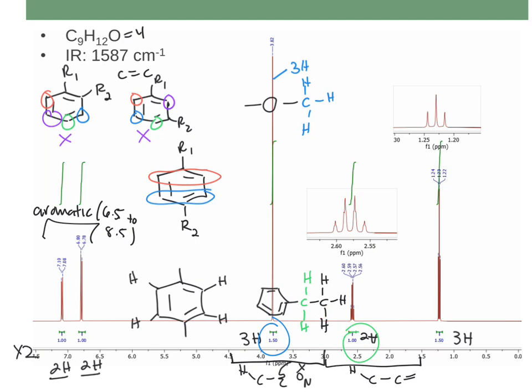But now let's just double check. Let's look at our last one. I think I can already build this, but let's check our last one here. Our last one says we have a CH3, because again, it's a 3H peak, and it's a triplet, which means it has two neighbors. So I'll draw two neighbors here in black. And it's between 1.5 and 0, so it's just alkane-like. Just pretty plain and boring, which that would be.